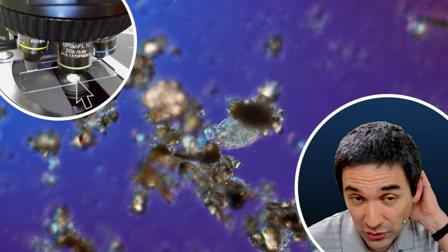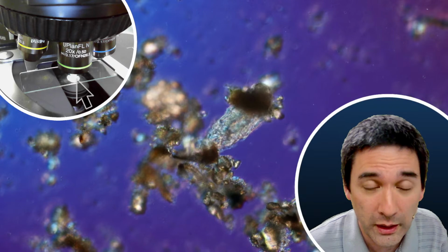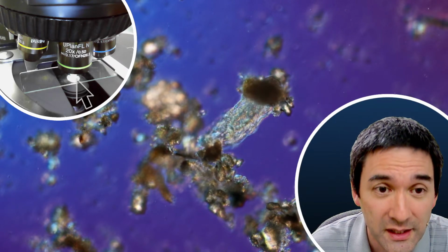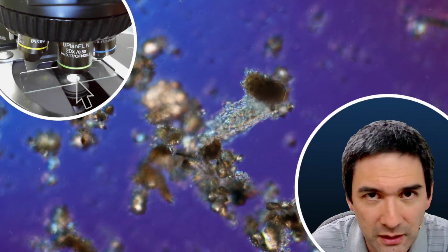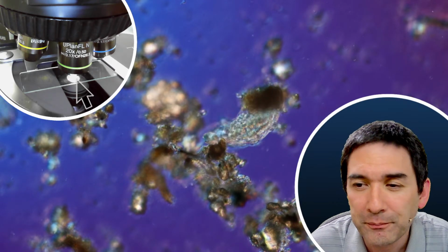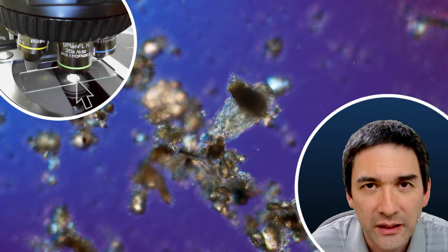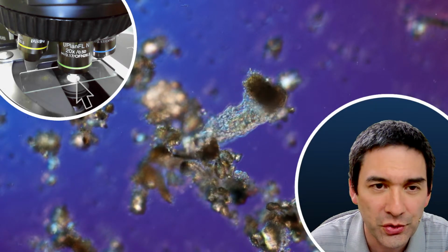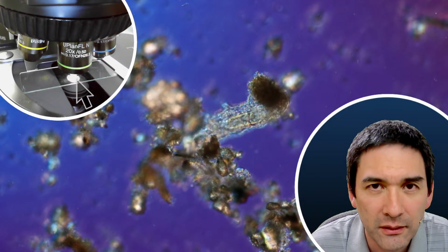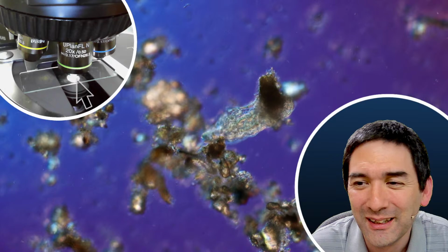What I would like to do in this case is find a better way of finding more of these tardigrades, because you see, I've been searching now for 10 minutes or so until I found this one over here. And then I would like to try to isolate them using my pipette a little bit better. So then I can dry them, and then we can do all sorts of experiments with them, right?